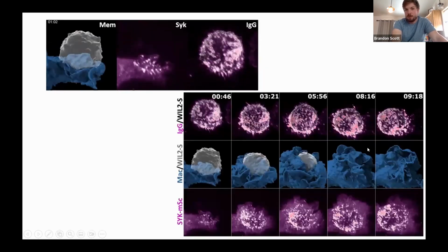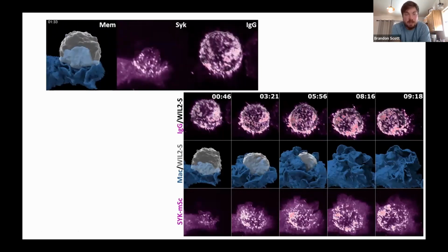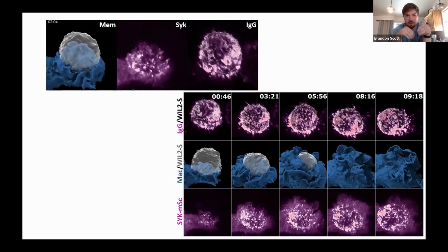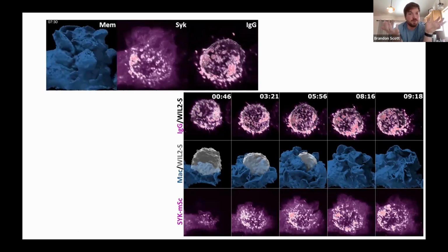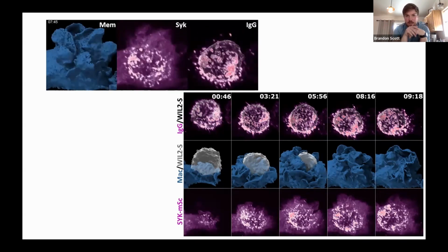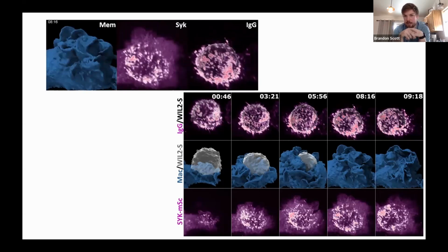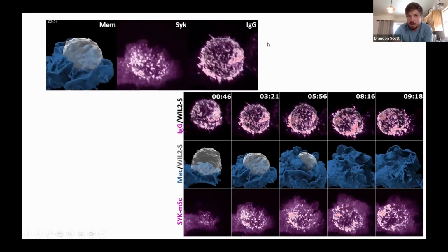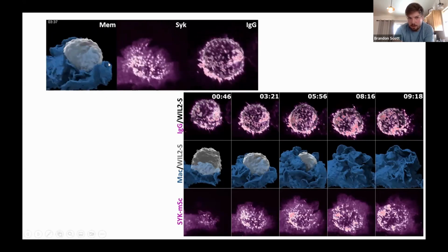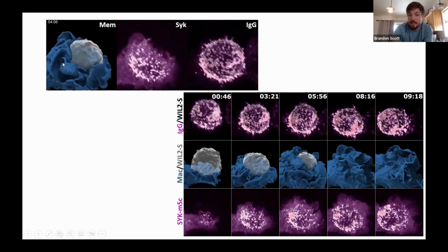Okay. And so, getting beyond that is where it becomes really challenging. So this is a very simple experiment in the lab here, where we're trying to understand the interactions of these diffraction limited spots that are representing antibodies here on the surface of a cell, a signaling molecule, and then the structure of the macrophage as it's eating it.